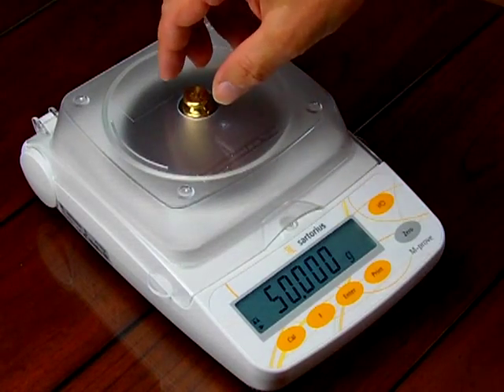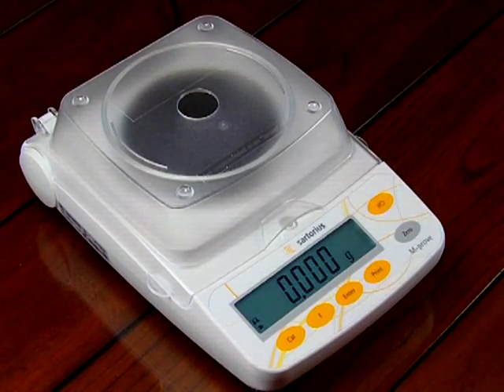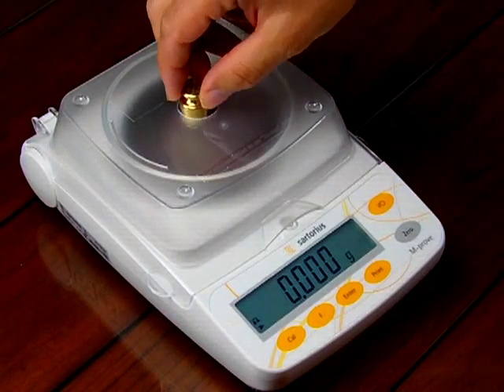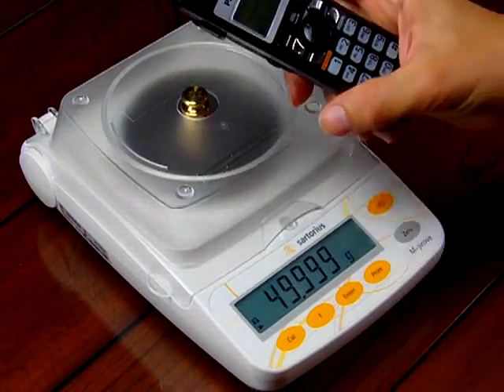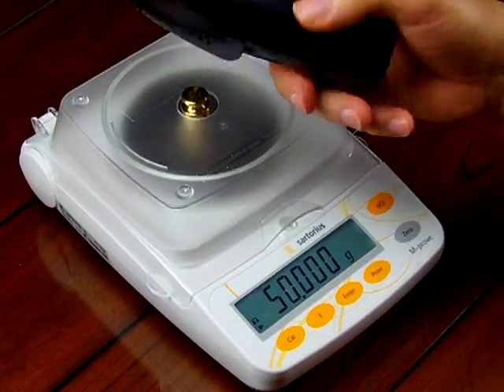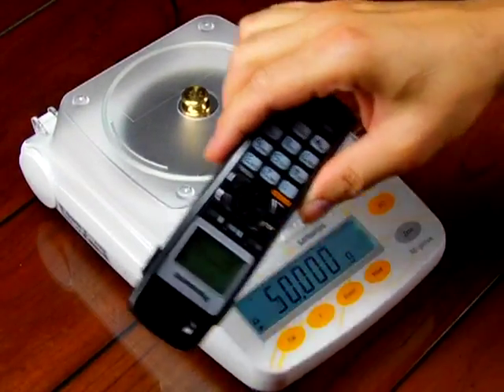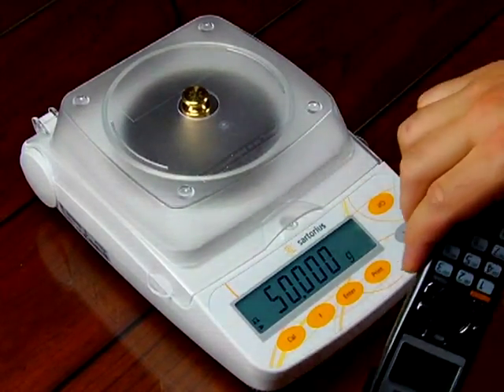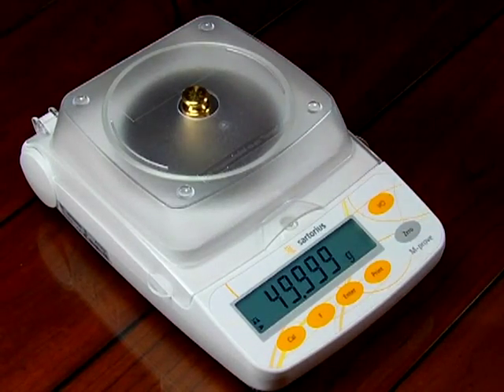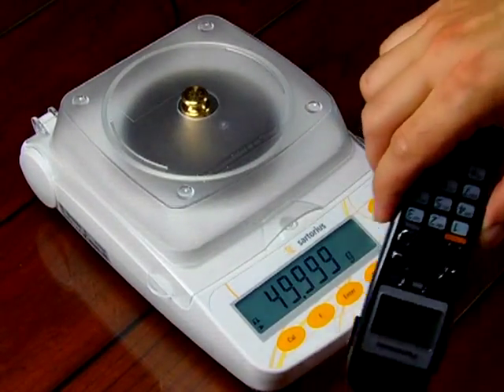If I take off my 50 grams and zero out the balance, then put my 50 grams back on — lo and behold, it's 50 grams. Now, I have here a Panasonic handheld telephone. You'll notice the phone right now is off. And if I move this telephone around the balance, you don't see any change in the display whatsoever — maybe one division, but that's just the strain gauge itself. Overall, it's a very stable reading.